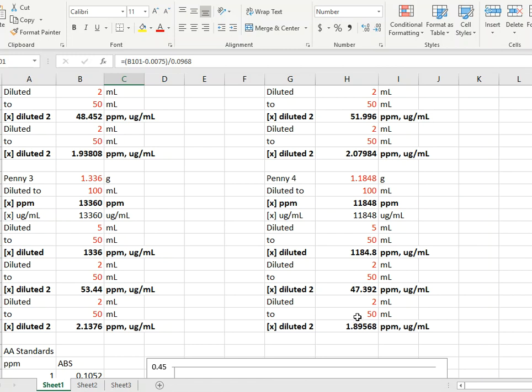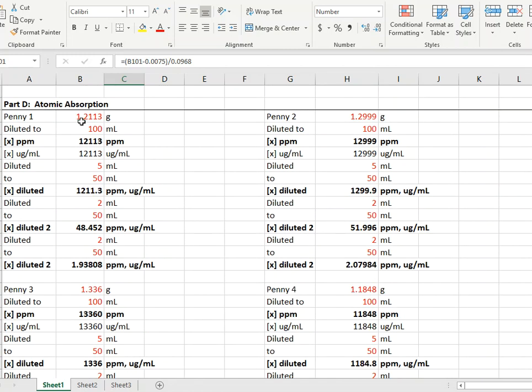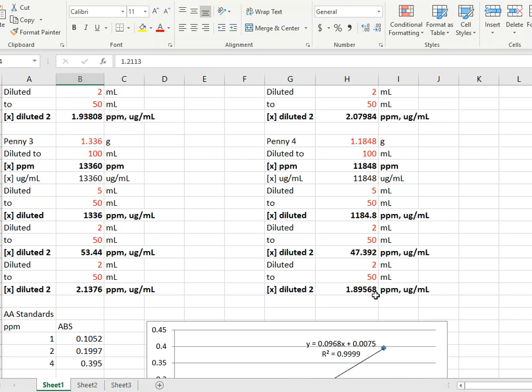And some people have questions on that sometimes. They don't really understand, well, where should I start with my calibration curve? Well, we kind of have an idea of what's present. We have an idea of what the concentration should be in the very end after all of these dilution steps, and we're going to build our calibration curve around that, and that's why we do it.